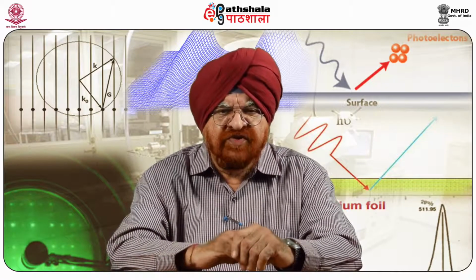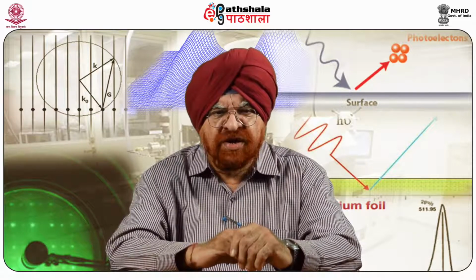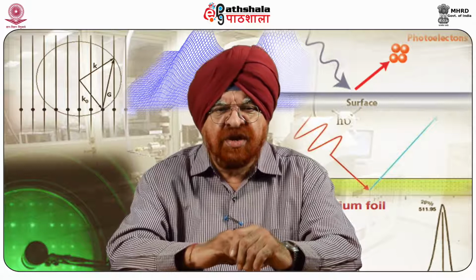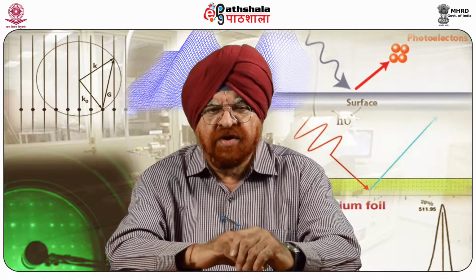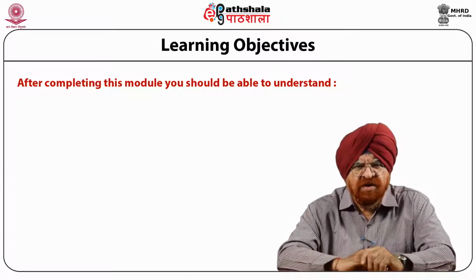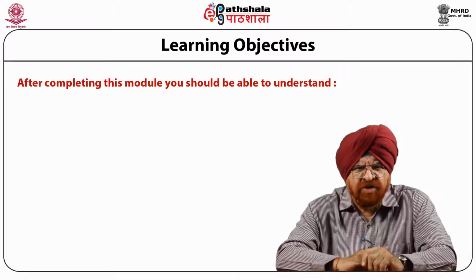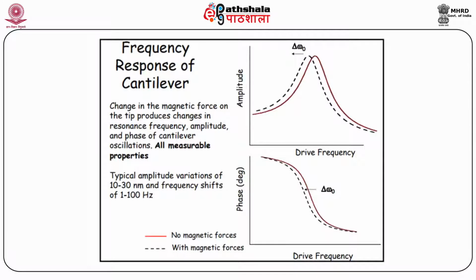Today we are going to discuss the module Magnetic Force Microscopy, in which we are going to discuss data analysis, and this shall come under the paper of Surface Analytical Techniques, Part 1. When we complete this module, you will be able to understand to a great extent the introduction, then results and conclusions. Frequency response of cantilever.